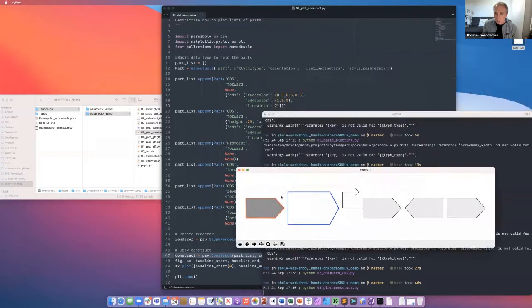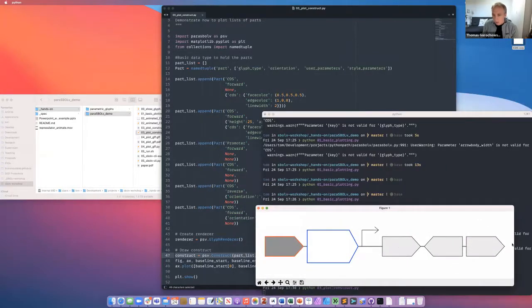So there you go, you can see it here on the axis itself. We added this because it makes it easier for people that often just need to render small segments of designs, and this allows you to very quickly create those objects and then just let the library do all the rendering aspects for you, which is really handy.